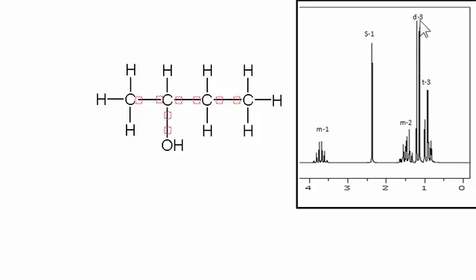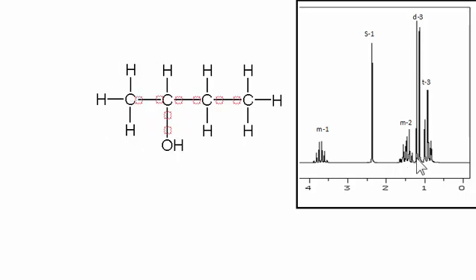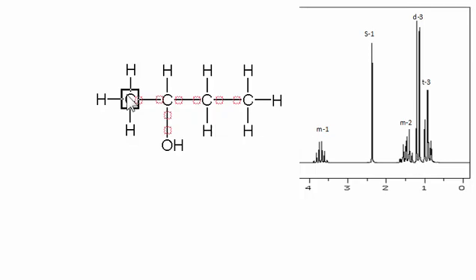This is a doublet, and it's around 1.2. Now this is also a methyl group, but remember, it's adjacent to the carbon with the electron withdrawing group, so this is shifted downfield. About 0.2 is what it looks like. So that's in this position here. It's only a doublet rather than a triplet, because there's only 1 hydrogen here next to this to cause the splitting. We called it coupling, if you remember from the earlier lectures. So this is coupled, and it produces 2.